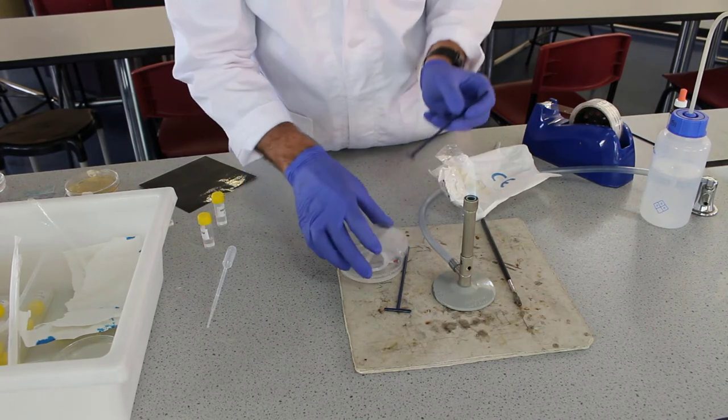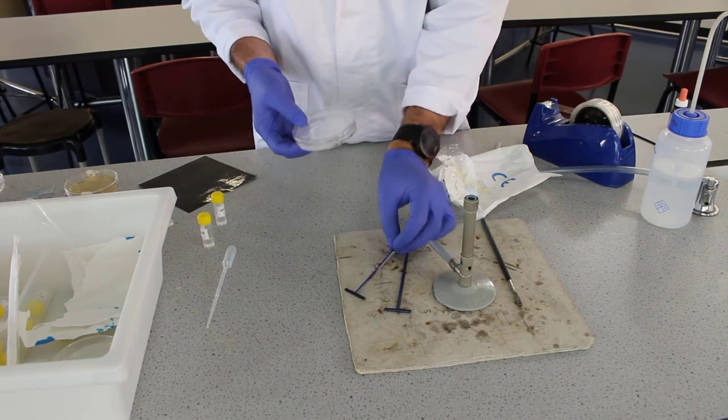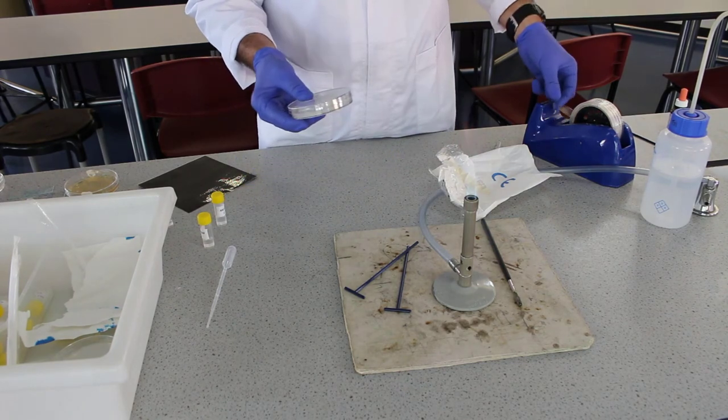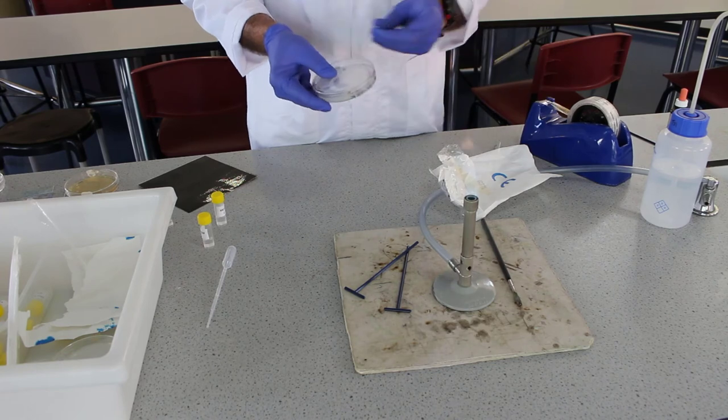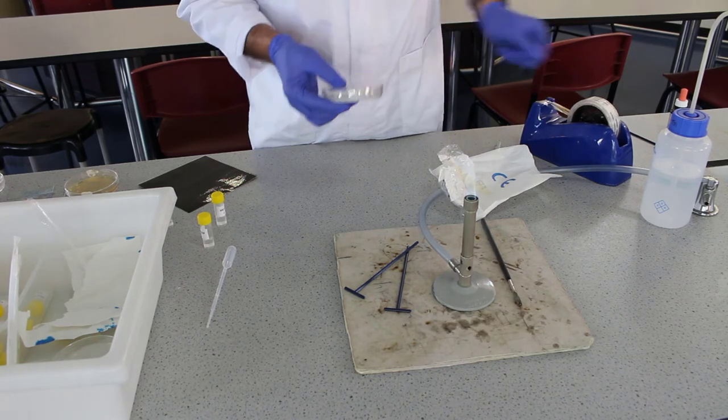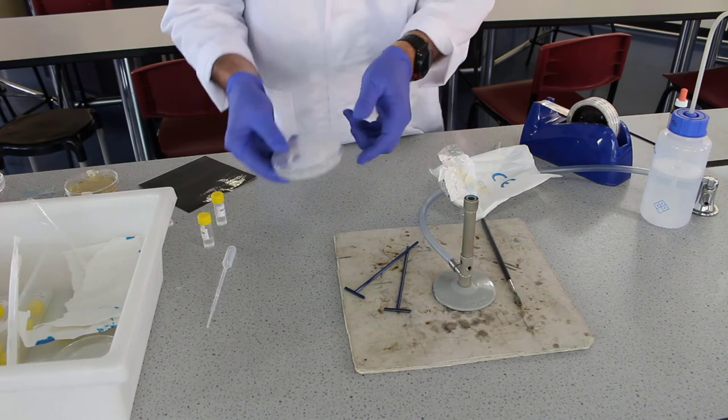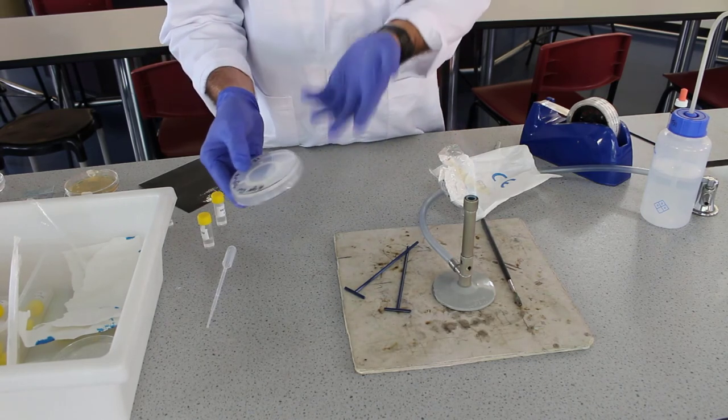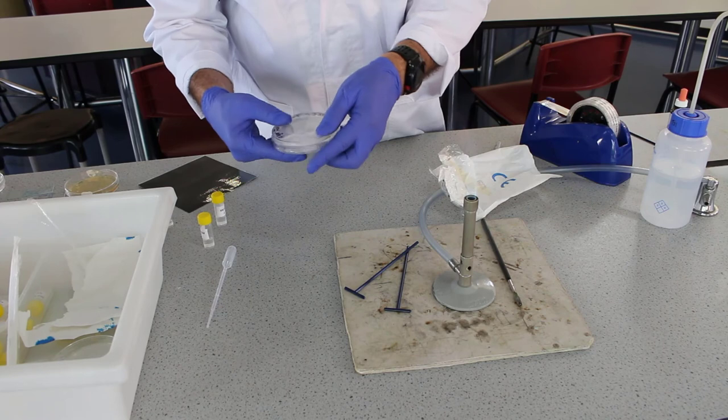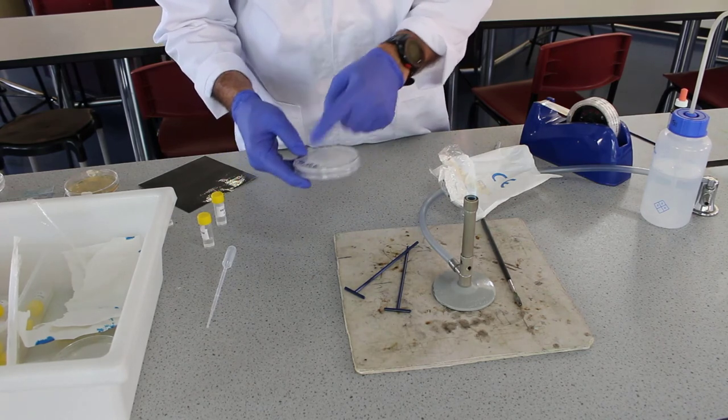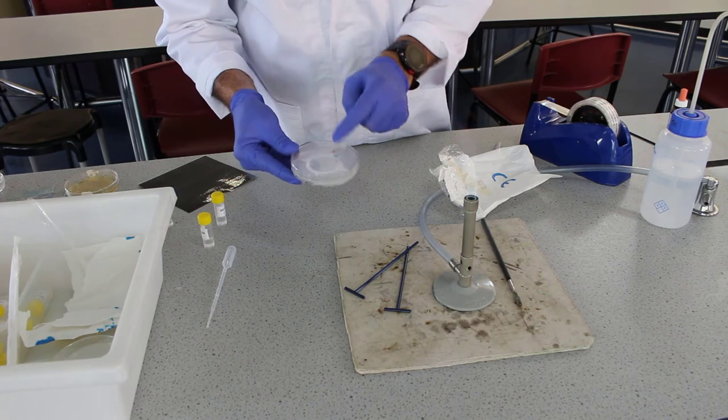We just need to push it down a little bit because when we put it in the incubator, we're going to put it upside down like this. To finish this off, a little bit of tape. This is going to go in the incubator for 48 hours. And what we're going to be measuring is the zone of inhibition around each of our antibiotic discs.